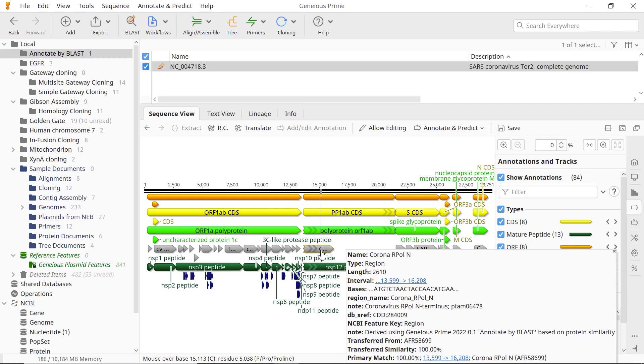Transferred annotations contain the annotation qualifiers from the original nucleotide sequence, plus qualifiers detailing the source of the transferred annotation and the similarity percentage.